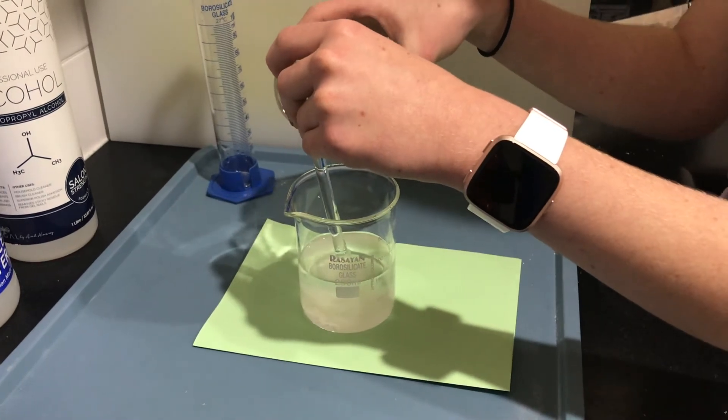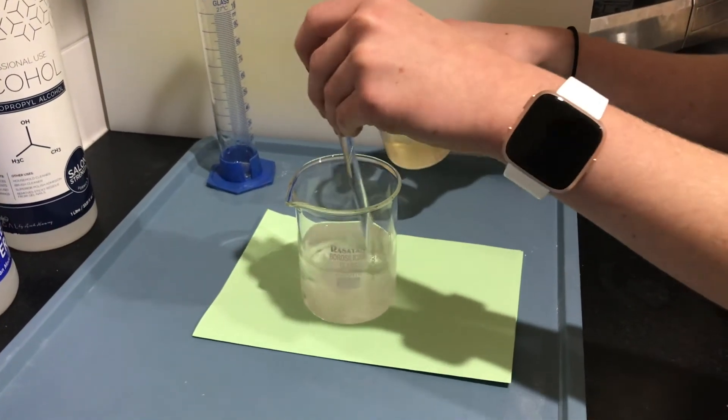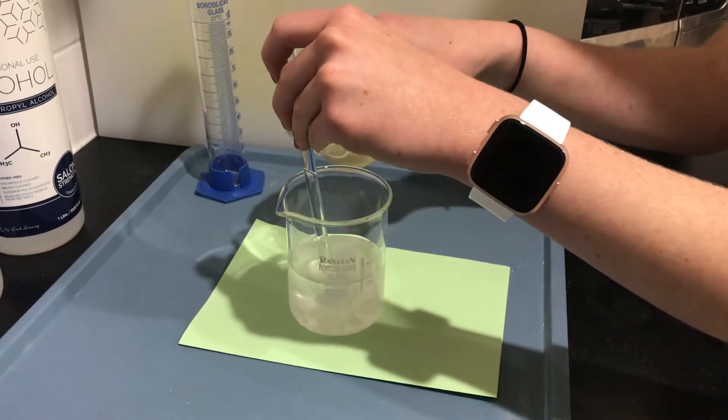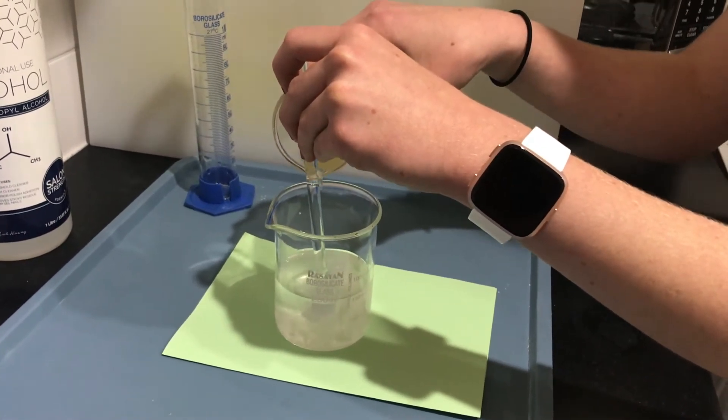Gradually pour the calcium acetate solution into the isopropanol alcohol. Between the two substances, there isn't any chemical reaction taking place, as it is a mixture of the calcium acetate, alcohol, and water.